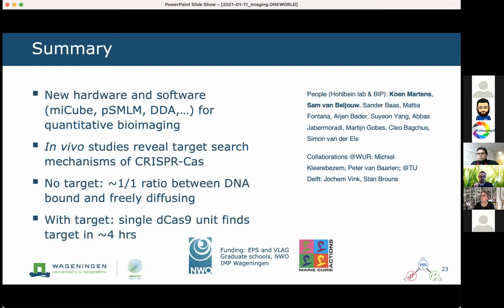What you can use is, people have used Halo tags, where you can genetically encode a Halo or SNAP tag, and then label it with an organic fluorophore. Achillefs Kapanidis' lab has shown that you can monitor tracking for a couple of minutes. However, it still creates the problem of counting. You cannot easily count, because you don't know how many you have. A lot of those dyes do not penetrate the cell wall very well. You have to use a very high concentration of dyes. Then they stick to the cell wall and you have more noise. So it's super complicated. Ideally, I would like to have genetically encoded, not blinking, and stable for 5 minutes. That would be great.